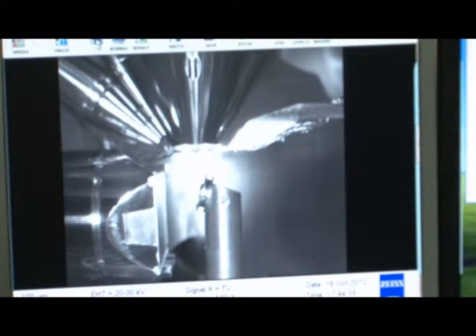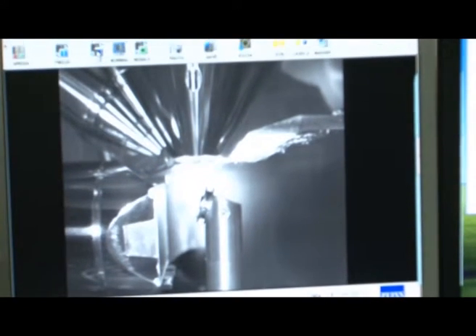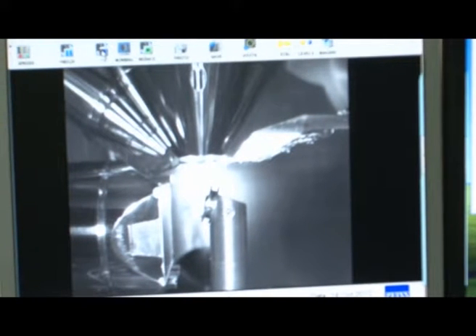and the camera which goes inside, and this is where the electron beam falls on the sample, and there are other detectors which are attached to any SEM or scanning electron microscope. Now we will simply go back to the original position, that is the sample. So, this is the backscatter electron image obtained when the sample is tilted.